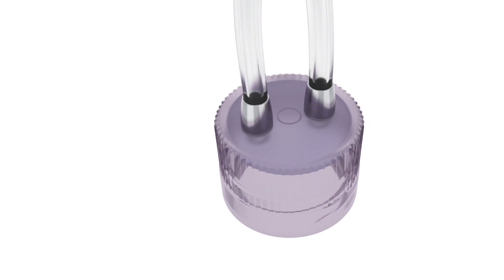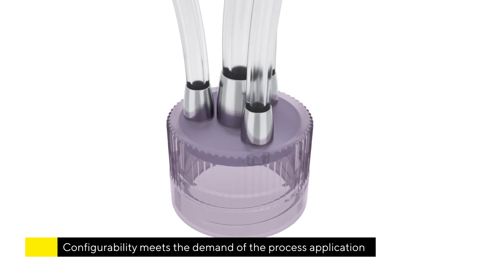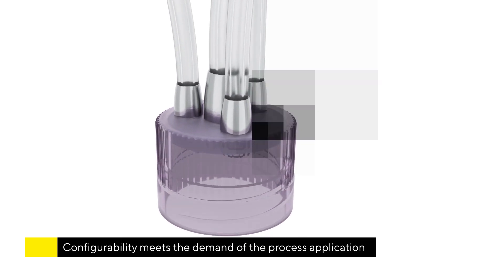Equally impressive to the range of bottles available is the configurability of MyCap. The port configuration is easily changed to meet the demands of the process application.